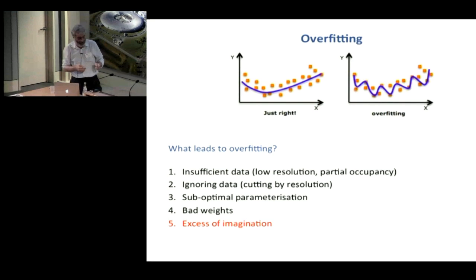In principle, how could it be done? There are several ways of doing it accurately. One of them is that if refinement is done against raw images, then it can be done very easily. However, it is not done at the moment. What we do is reconstruction, and then we fit into the reconstructed maps.